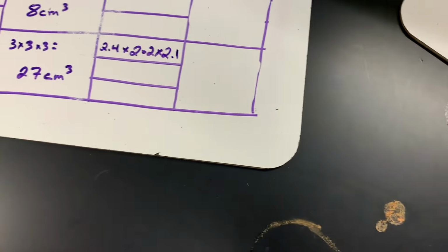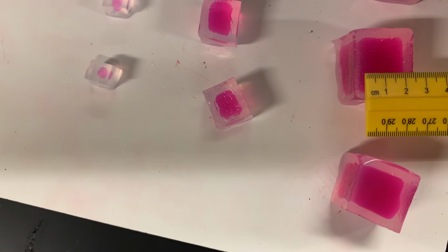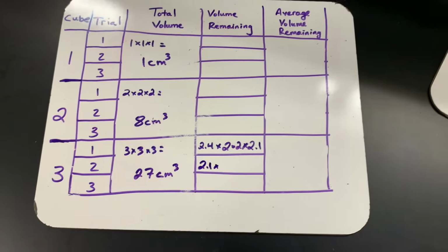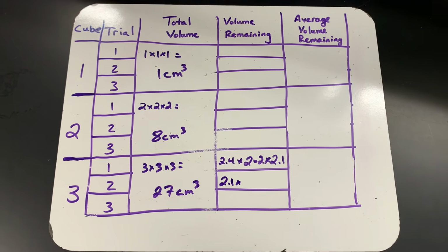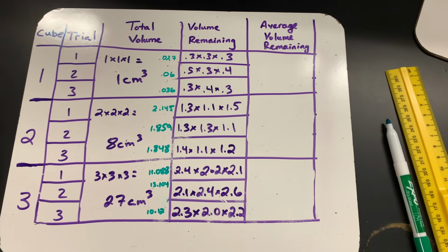Okay. Next one. We got about 2.1 there. Okay. You guys can see how to do this. We're going to do length, width, and height for each one. All right, so I'm going to do measurements for these, and then I will come back and show you guys my data table nice and filled out. All right, so back to you guys.